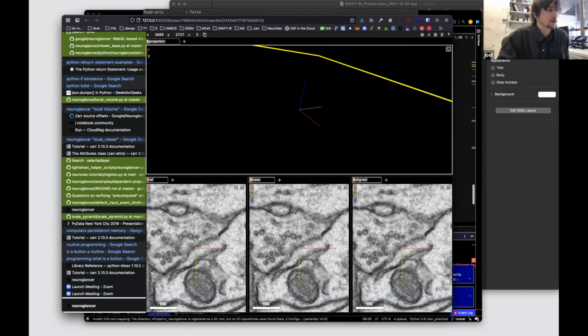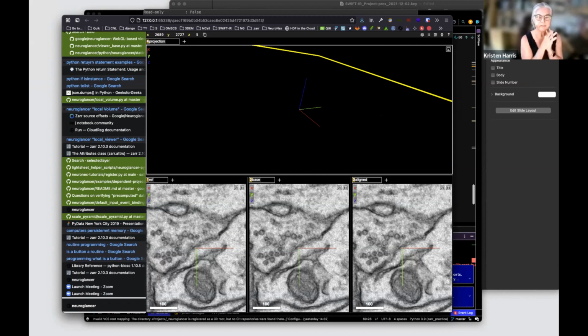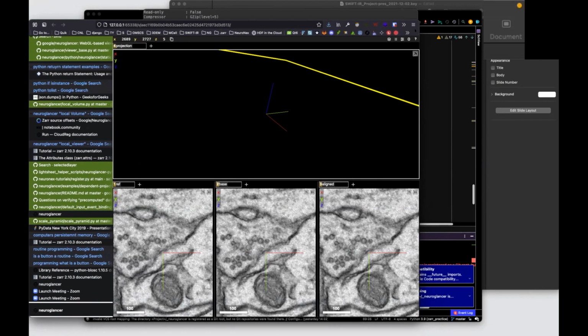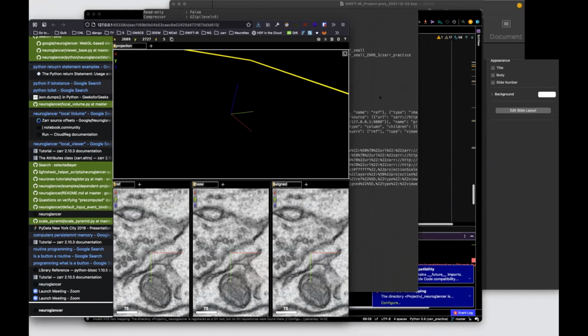In other words, her trace could be laid on top of the images that you have here as she's working with it, right? Not at the same time. Do you mean like would our browsers be in sync? I'm not sure I follow what you're saying. Her tracing will operate on images like this, and yes, that's the next step for us.